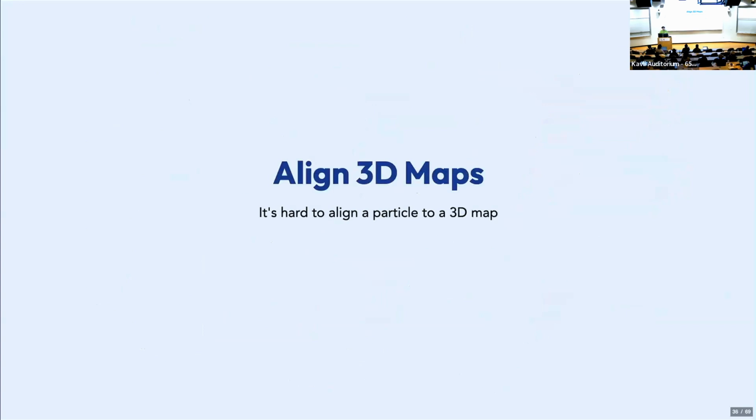This is what a great job called Align 3D Maps is for. Okay, so the problem we've been struggling with is, remember that our particle images are horrible, right? Telling where a calmodulin is in an individual particle image is really, really hard. Telling where a calmodulin is in a map is really easy. You can just look at it and point, right? What Align 3D Maps does is it lets us say, okay, these particles all belong to this map, and we know they have some pose.